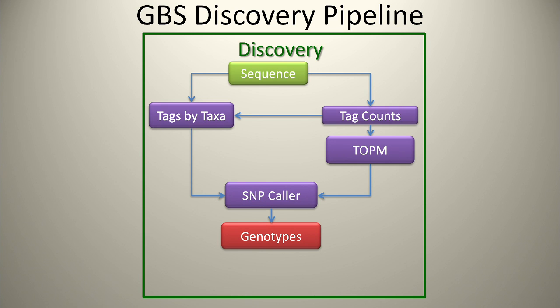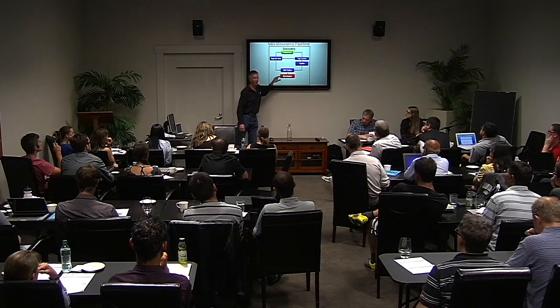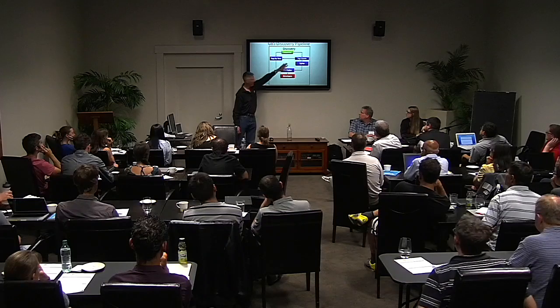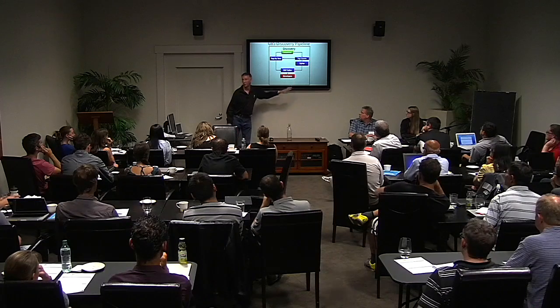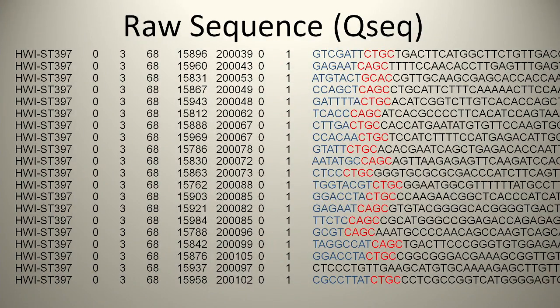This one, I think, we've had many, many iterations of this diagram. This one is one that I think conveys the ideas pretty well, and is reasonably simple. So it has all these parts with the arrows telling you where things are going. Information is coming from the sequence and informing this, and so on and so forth. And finally, the goal is to get from here, the sequence, to the genotypes, right? That's our goal. Okay.